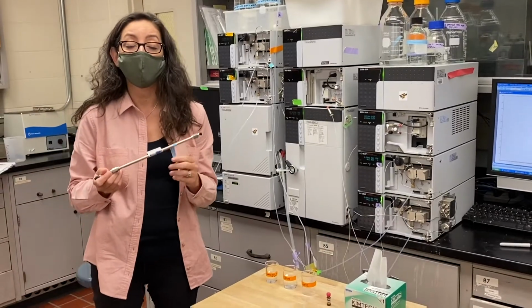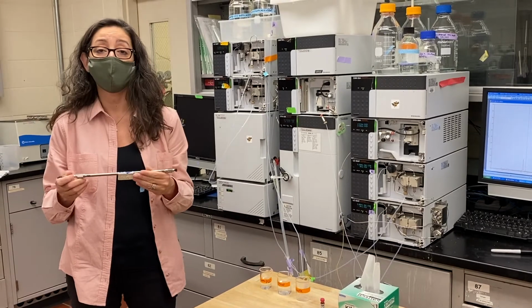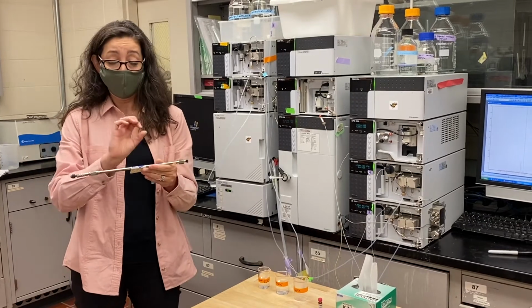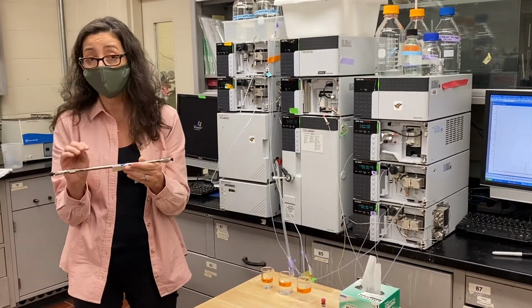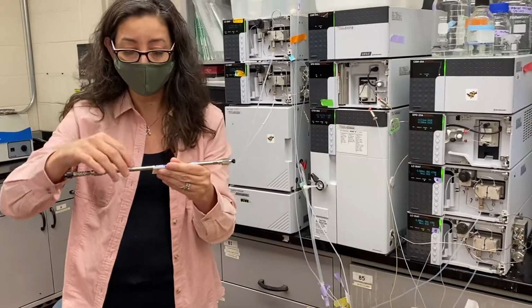Today you are going to separate caffeine, detect it and quantitate it. So what you're going to do in the lab is prepare different beverages, and then you're going to separate the components of the extracts using this column, and then you're going to detect caffeine and quantitate caffeine.